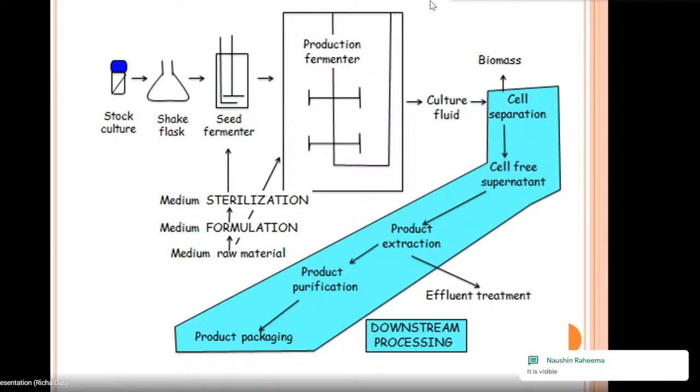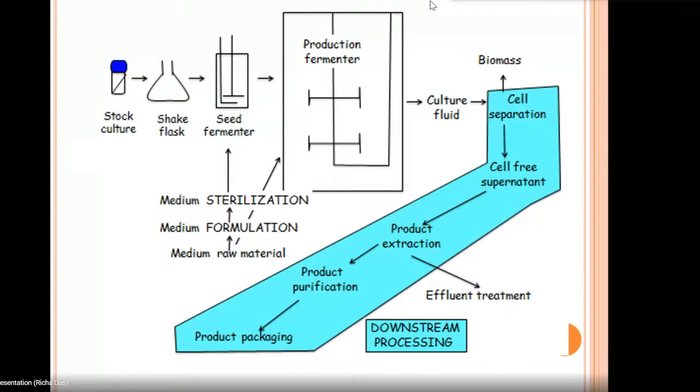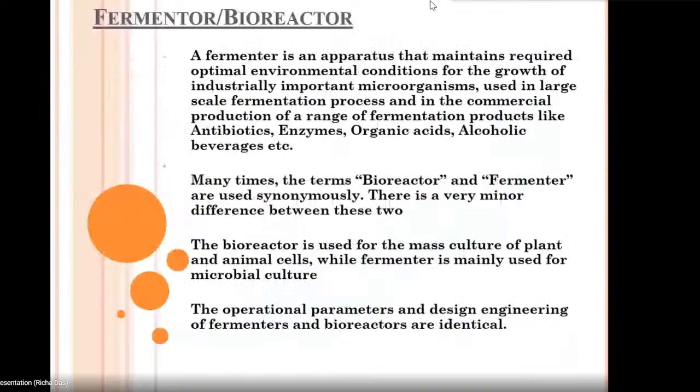The byproduct will go for the effluent treatment. Then it will either be disposed of or given to some other industry or country. Then the product will be purified, and finally my desired product will be packaged, and then it will go to the markets. So this is the whole process. Okay, now we will see what a fermenter actually is.